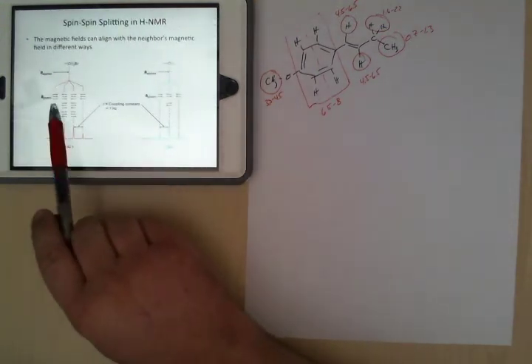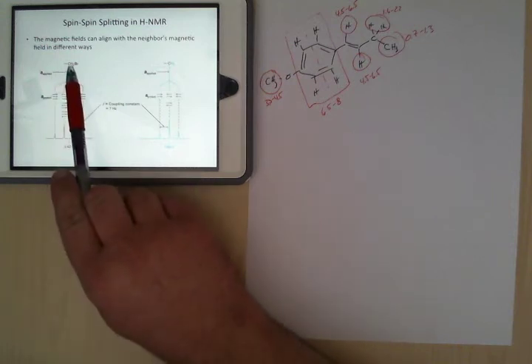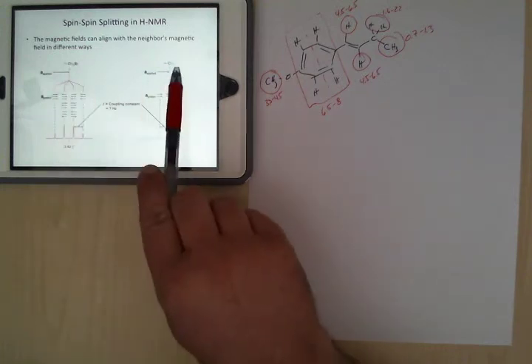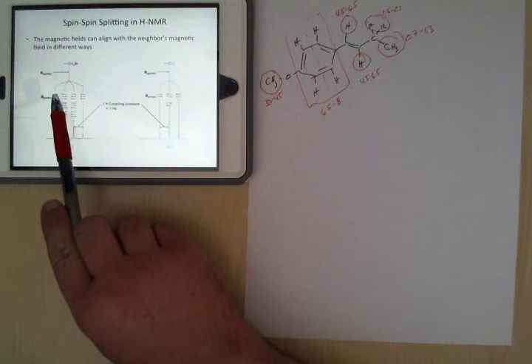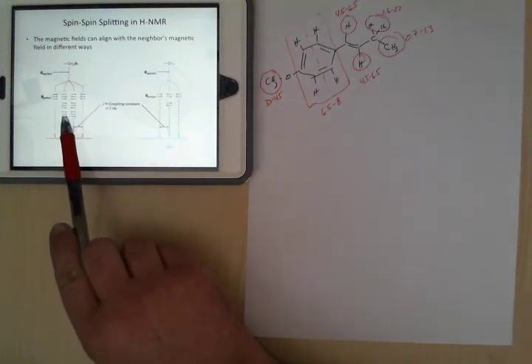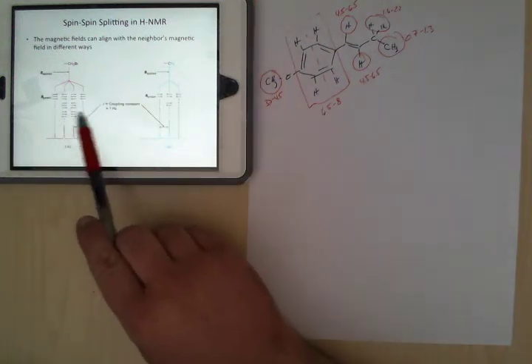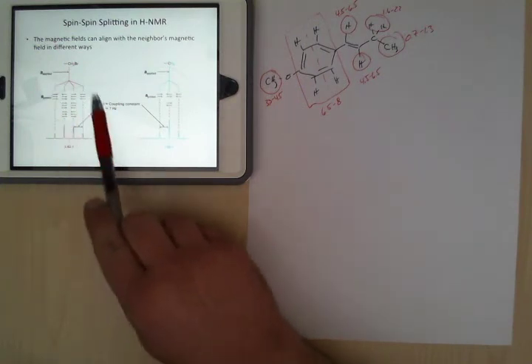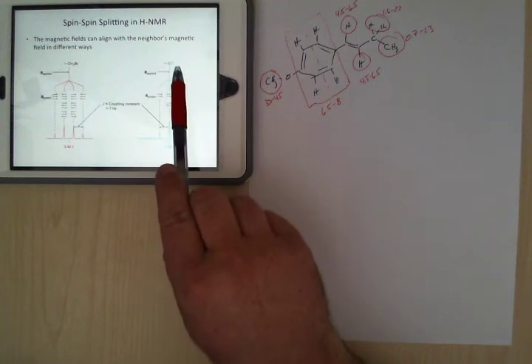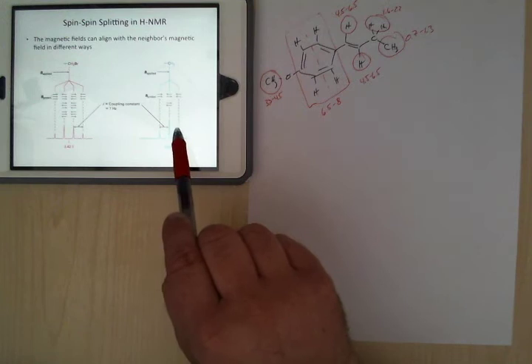So we have these hydrogens here. The combination of this CH2 with the 3 next to it, you could have all one way. You could have one of them going one way and the other 2 going the other, or the opposite, or all going that way. These are the 4 combinations you can have with this signal next to these 3 other hydrogens. These are all 1, but you have 2 over here, and so these are the possible combinations of them.